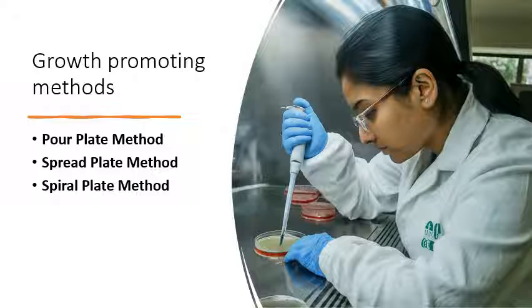Most of the requirements: petri dish, the broth containing microorganism, the agar, the Bunsen burner, and so on and so forth. Now, every microbiologist knows that before you carry out any culture, you have to sterilize your workbench and sterilize your hand, put on your hand gloves, just like the person in this picture.